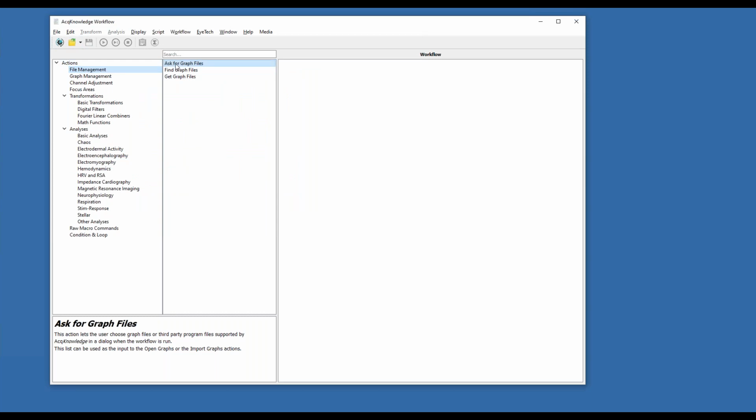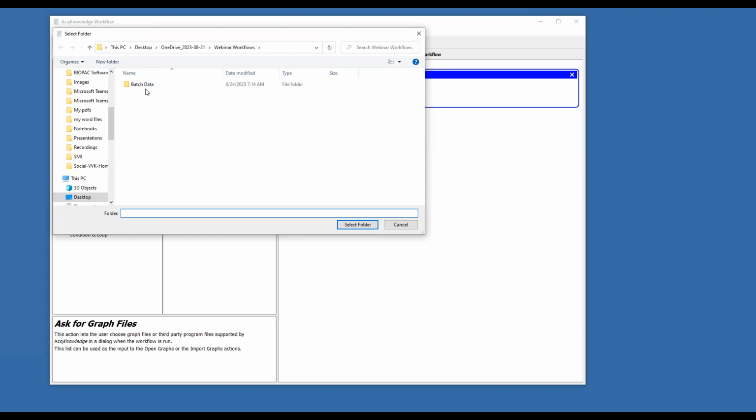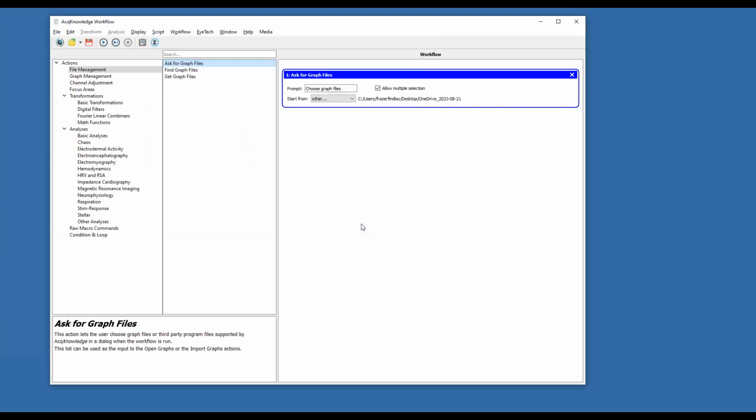So if I just move this back in, set this back up again. Okay, so now this is enabled. I can save this, give it a name. Then these options here, these are the classic play. So this is going to run the workflow from beginning to end. This option here is very handy. This will allow you to run step by step through your workflow.